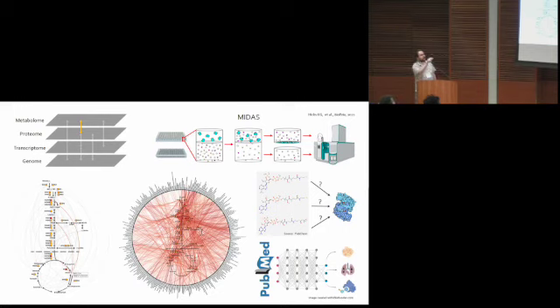And we allow these 2 chambers to reach equilibrium. And so you can think if a metabolite is interacting with a given protein, it's going to be enriched in one chamber. And so after this, we crash out the protein and then feed these chambers through mass spec to measure what's the enrichment of each of these metabolites in the protein chamber.